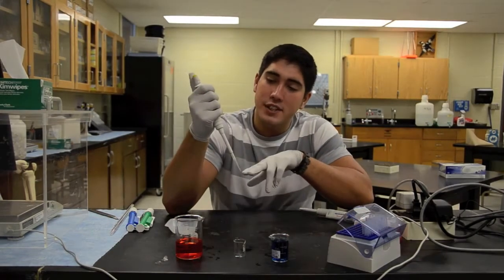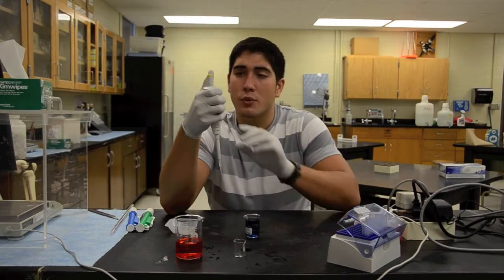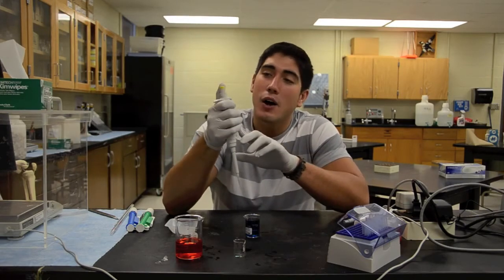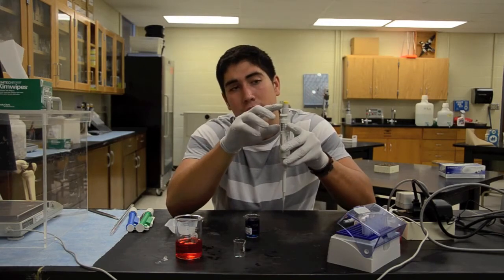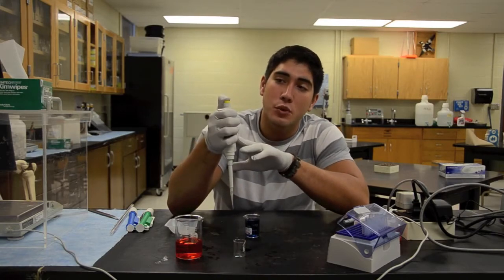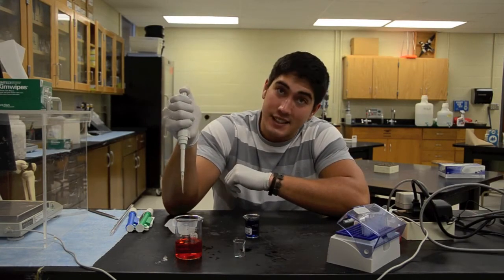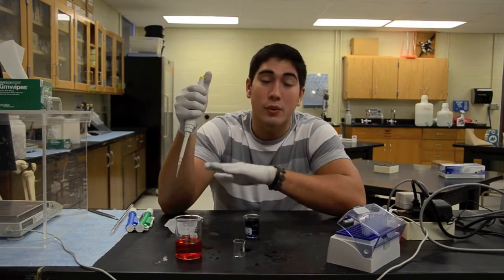Alright, now that we have our tip on, I'm going to show you how to get some liquid out. We have our volume set to 200. This is going to pull 200 microliters of this nice blue liquid that we have here. Before I extract the liquid, I want to show you the different levels of the stop. There are two different stops. The first one is the stop that we use to actually extract the liquid. Once the liquid is up, we push down to the second stop in order to excrete the liquid into whatever solution we need.